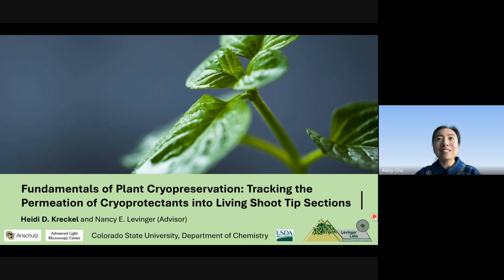And I just also wanted to say that she's going to share with us a little bit of the story of how she got into this field of research and also how she's using the vibrating microtome with it as well. But more importantly, in today's session, Heidi will be sharing her research on tracking cryoprotectant permeation into living peppermint shoot tips and how the Compresstome vibratome played a crucial role in prepping the plant tissues for high-resolution microscopy.